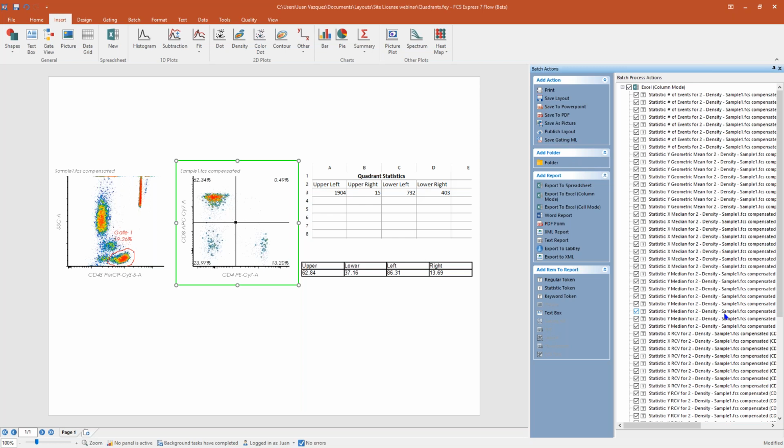Okay, and then just like before, when you click Run, FCS Express will process this Excel export, with all these values being written as separate columns in that output file, where each stat is a separate column. Each iteration that you may be playing through a particular FCS Express layout will be a separate row in that output. Okay, very convenient, very easy to do, very intuitive.